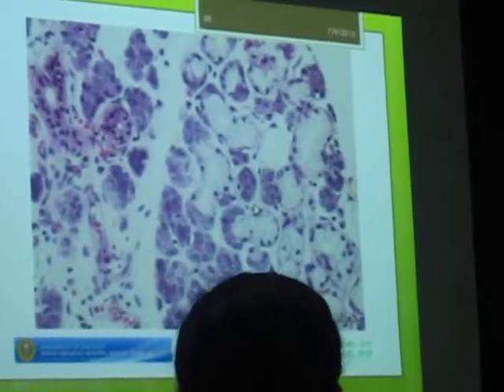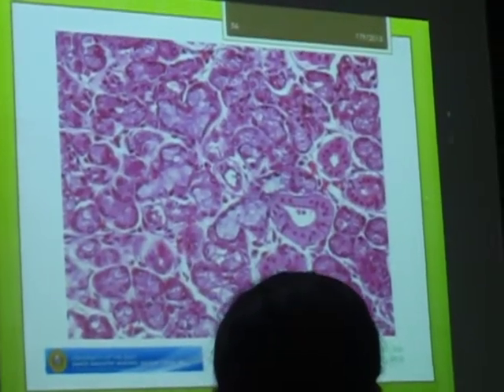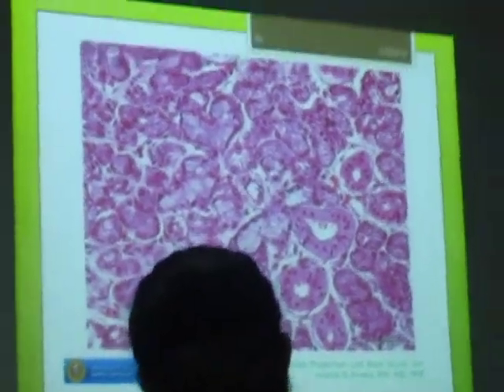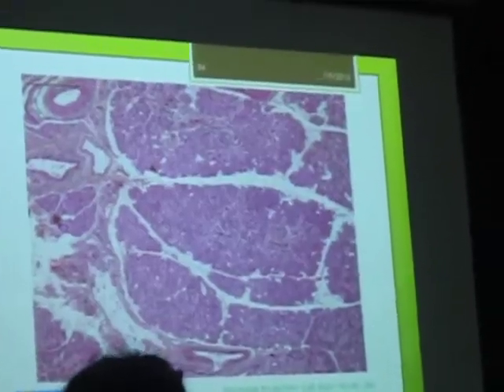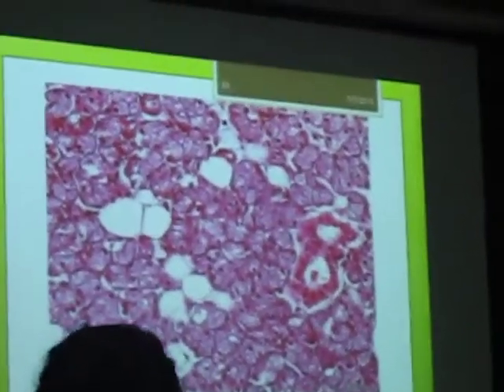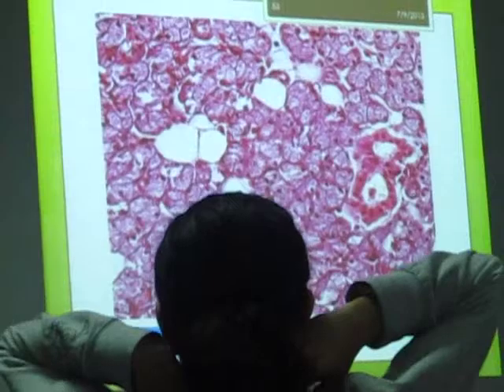Okay, so during the examination, if we want you to classify it, we will focus on the area wherein you can see both the mucus and the serous. You don't have to search for it. If you see purely serous, we focus on this area because it's all serous. There's no other component.